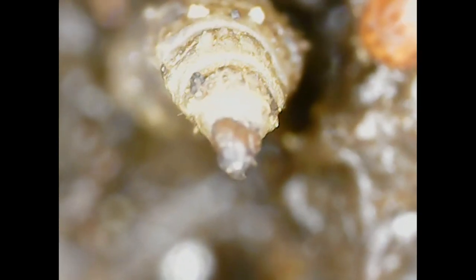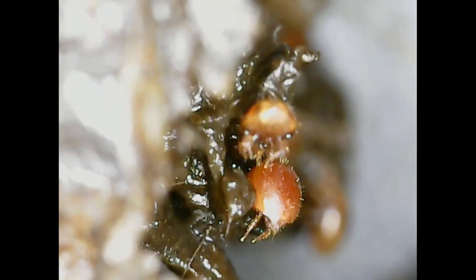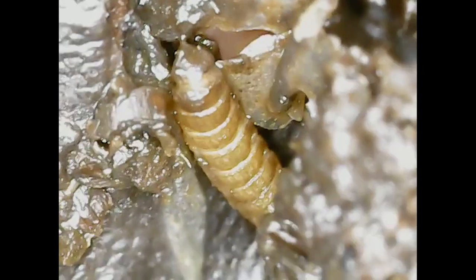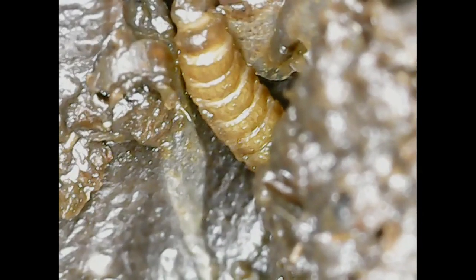It's got things living on it too. Another maggot of some sort, probably fruit fly. Some more mites hanging out down there. They're kind of starting to warm up, I think, from just me being next to here and breathing on it and stuff. My warm breath is kind of waking everything up.